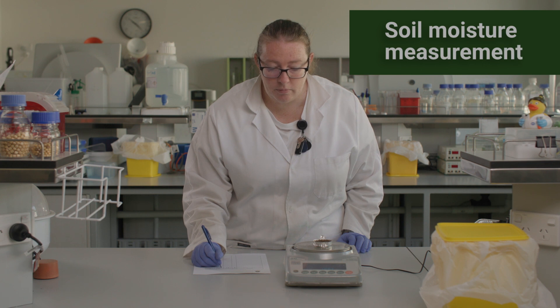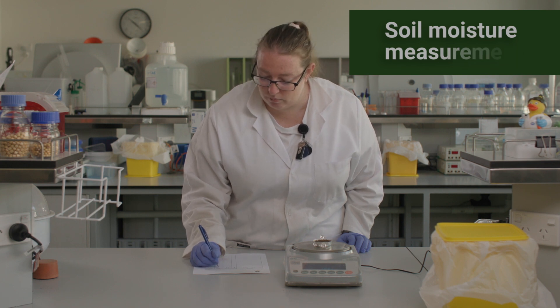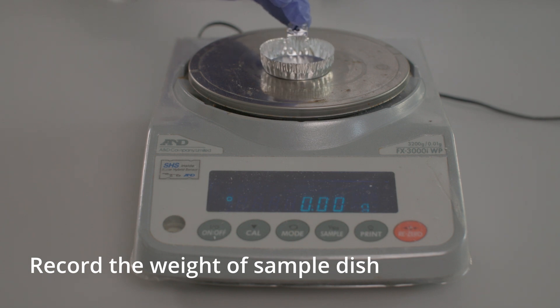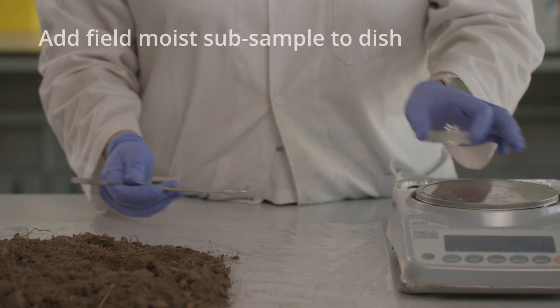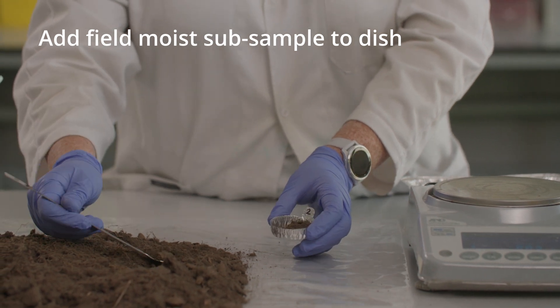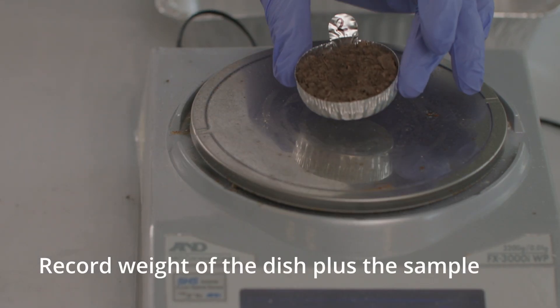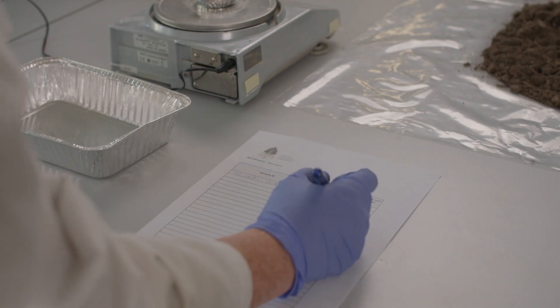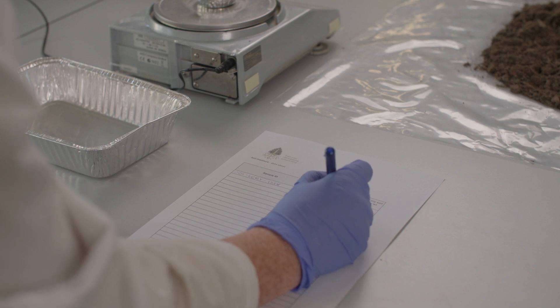Soil moisture measurement is necessary to obtain a soil moisture factor. Record the weight of a small labelled aluminium sample dish. Add a 10 to 20 gram subsample of field moist soil to the sample dish. Weigh the dish plus the sample and record the weight to the nearest 0.01 grams. Record the total weight on the sample data sheet.